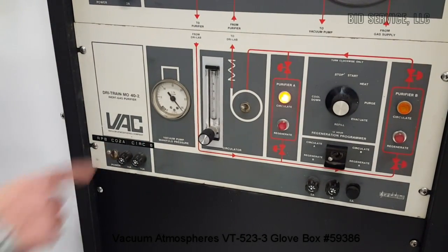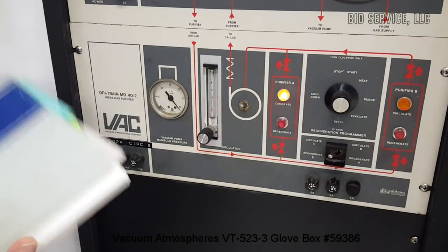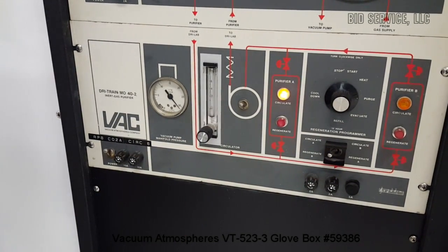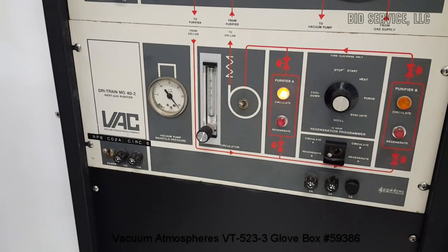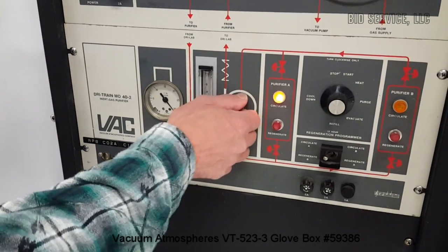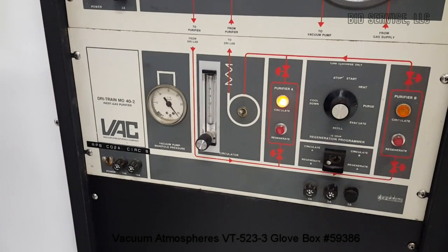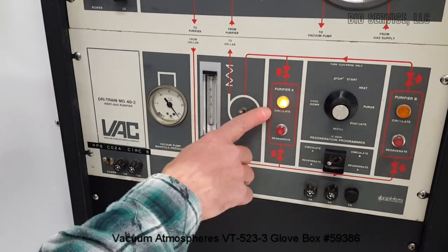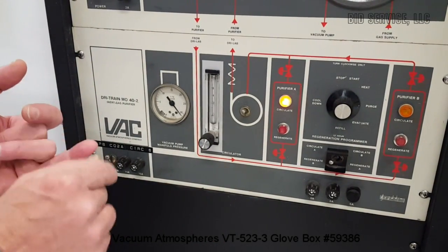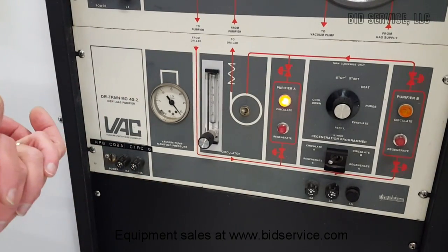This is our Dri-Train MO 40-2. We have a manual provided that explains what everything does. We have a circulator here — you just switch it on and off. There are two purifiers in here and the media has been replaced. I've done one regen per purifier, but I recommend doing another regeneration once you receive the system.